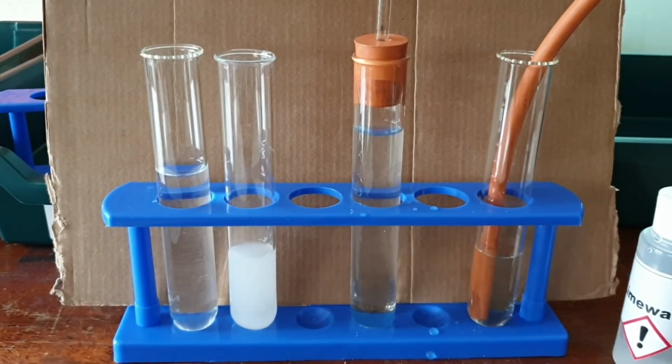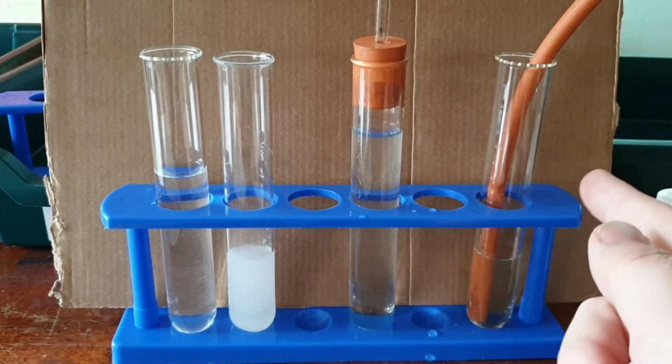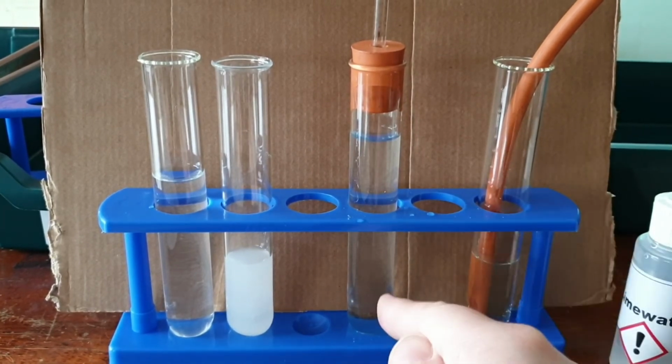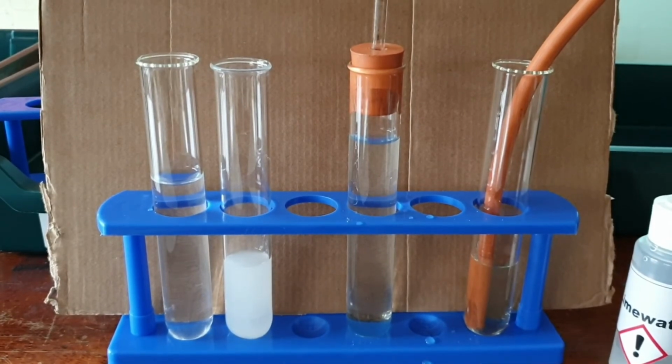And that's the test for carbonate. So it's actually the test for carbon dioxide. So you add an acid. If you get a gas, it must be carbon dioxide. Sorry, add an acid, get a gas, test the gas. If the gas is carbon dioxide, we must have started off with a carbonate.